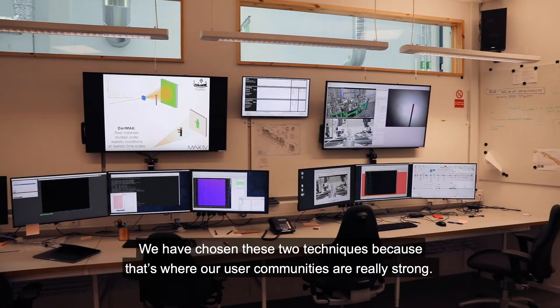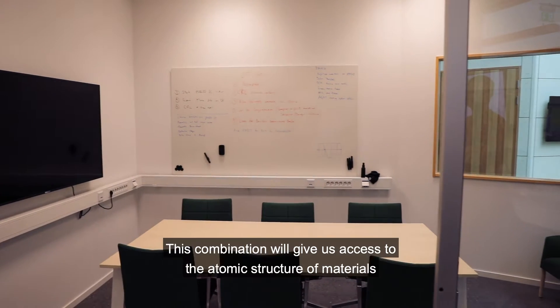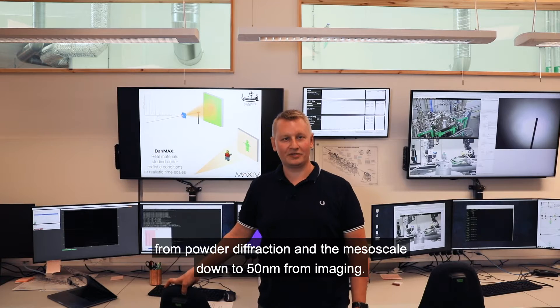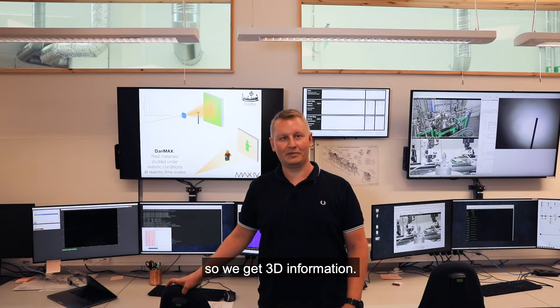We have chosen these two techniques because that is where our user communities are really strong. The combination will give us access to the atomic structure of materials from powder diffraction and the mesoscale down to 50 nanometers from imaging. The imaging technique is also combined with tomography, so we get 3D information.